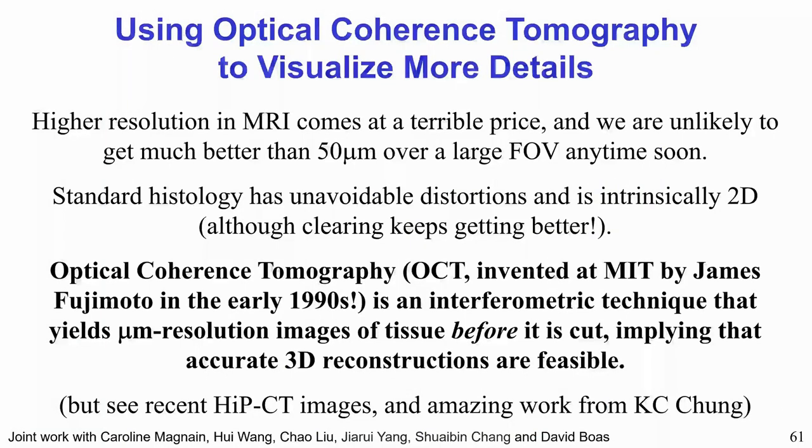Okay, on to the last part of the talk, which is our attempts to develop a new microscopy technique. And this is something that David Boas and I started, oh, I don't know, a long time ago now, maybe 15 years. And so we've been pursuing this technique called optical coherence tomography.